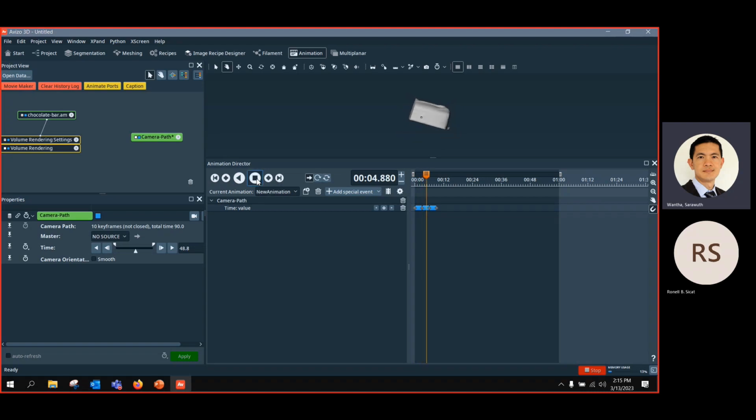And you can see if you just don't define the stop of the movie, it will keep running until the end. So you need to define where you want to stop your movie. Otherwise, it's going to keep running. So the next step is you want to add something else, like translation of the auto slide or clipping plane.